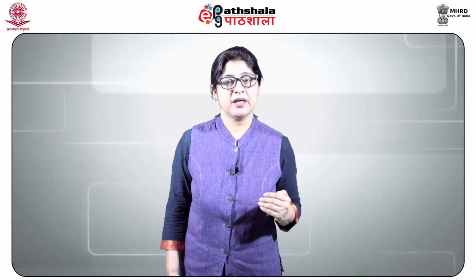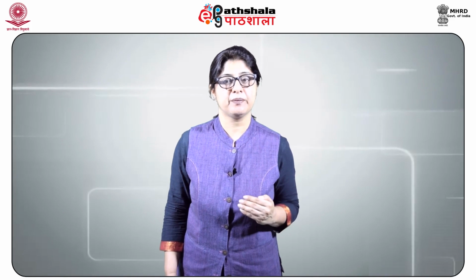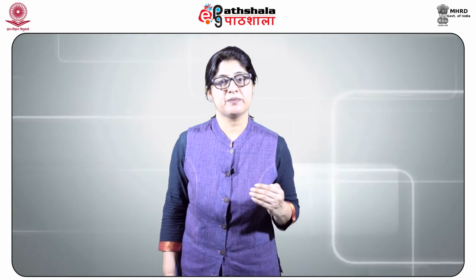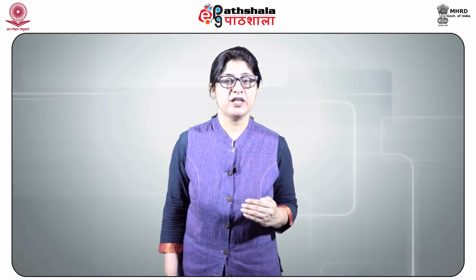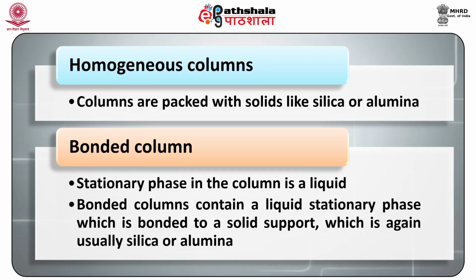Column. Columns are typically made up of stainless steel. Their length ranges between 50 to 300 millimeters and the internal diameters between 2 to 5 millimeters. They are packed with stationary phase particles of size 3 to 10 micrometers. Columns are packed with solids like silica or alumina. These columns are called homogeneous columns. If the stationary phase in the column is liquid, the column is termed a bonded column. Bonded columns contain a liquid stationary phase which is bonded to the solid support, which is again usually silica or alumina.